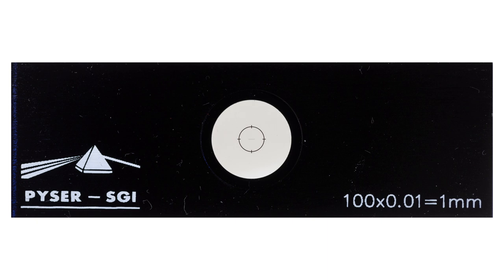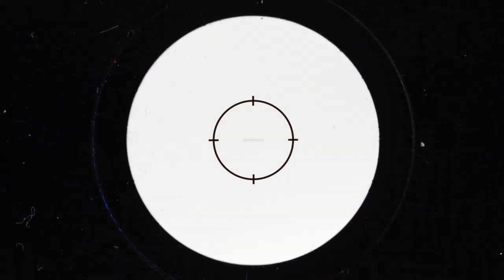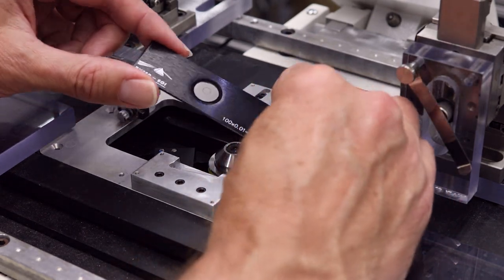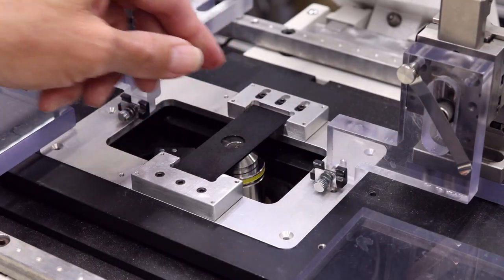Today our specimen is a micro scale that is generally used to establish the final magnification of recorded images. The actual tiny ruler is only one millimeter long. It is located in the center of the circle, whose equator and poles are marked by short cross bars. Because our microscope is an inverted microscope, we're placing the micro scale upside down on the specimen holder.